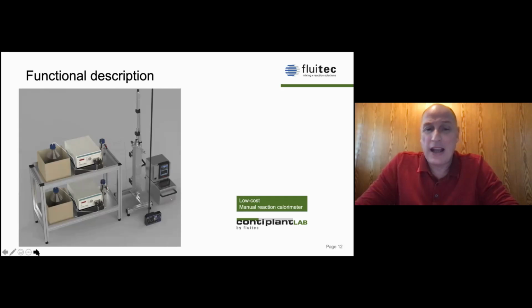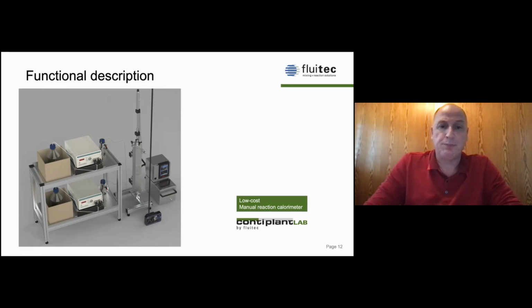And this is a low-cost manual reaction calorimeter, which can be used handheld. So you just set the flow rate on the pump, you run the system, and you can measure the temperature profile. You note the numbers and you analyze them with a simple software.